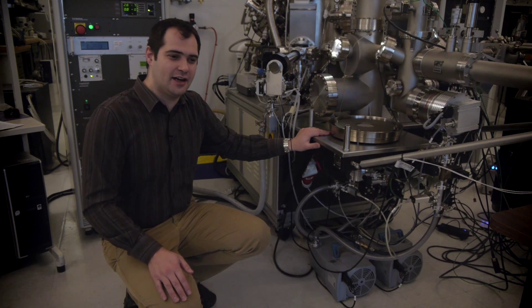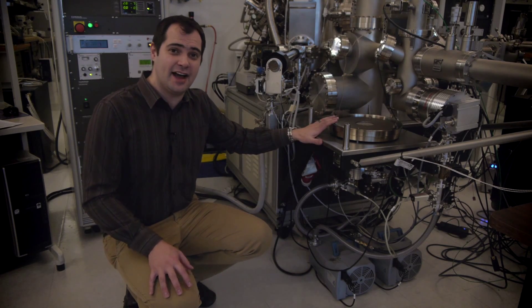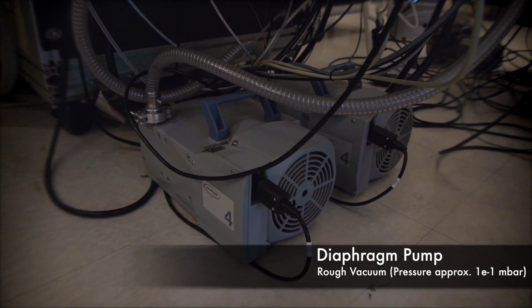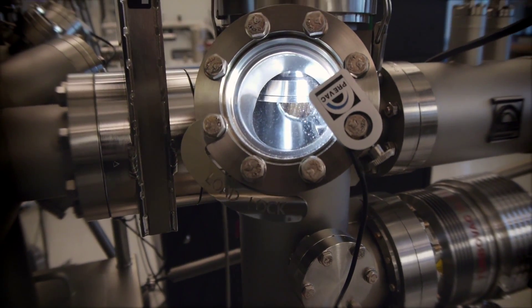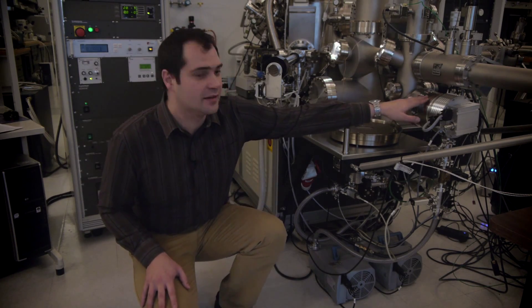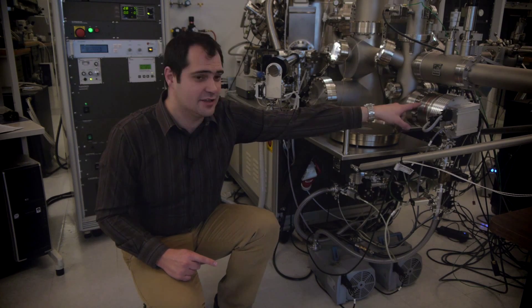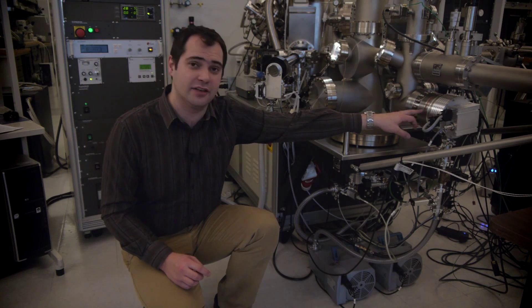As I mentioned, we have a pressure difference between atmosphere and those pressures comparable to those in space. How do we achieve these? The first part is we have to achieve what's known as a rough vacuum. Here we use a diaphragm pump, which will pump the lines and the whole chamber down to a rough vacuum. At that point we can start bringing on our turbo vacuum pump. Turbos can only operate at good pressures, which is why we still have to run the diaphragm pump through the turbo. The turbo can bring us down to much higher vacuums, or even ultra-high vacuums, depending on the size of the turbo.